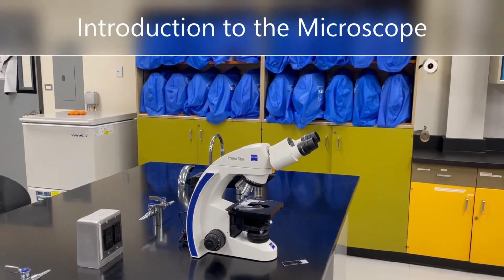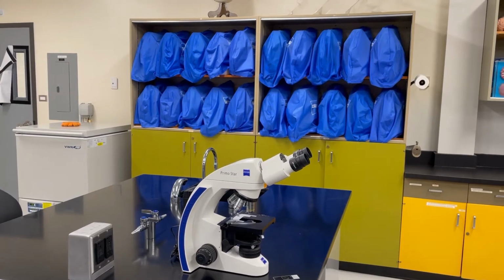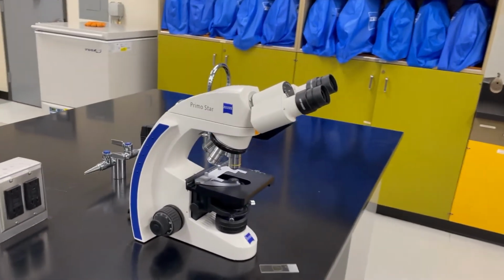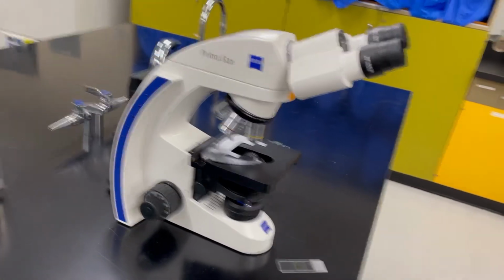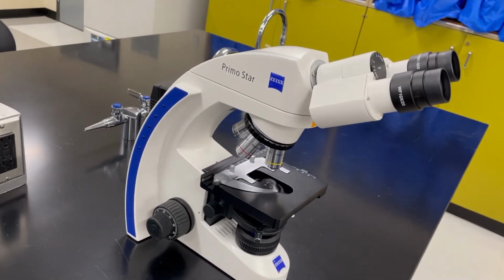Today I'm going to introduce you to the microscopes that we use here in the Biology 107 lab. In fact, you can see a whole bunch of the microscopes that we use in the biology lab on that shelf behind with the blue coverings. So here is our microscope. It is called a Zeiss Primo Star microscope. And what I want to do is introduce you to some of the parts and the functioning of the microscope. So let's take a look at this thing.